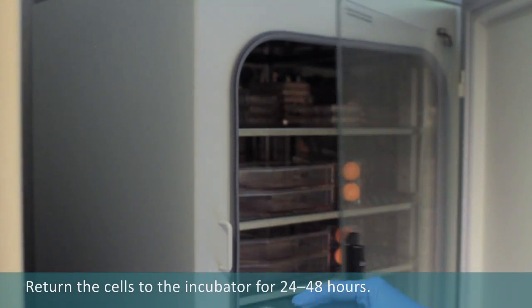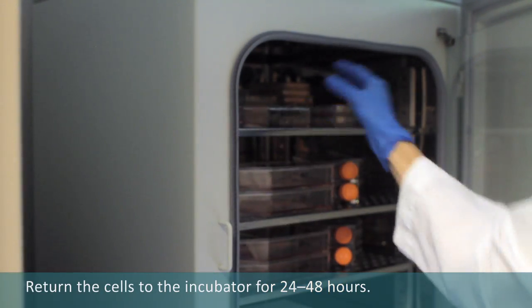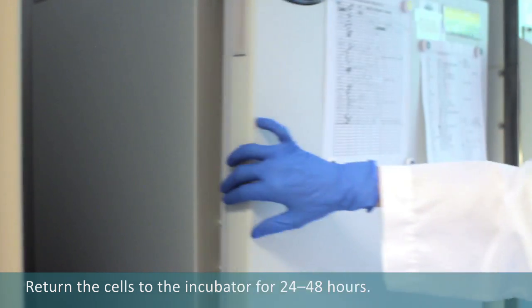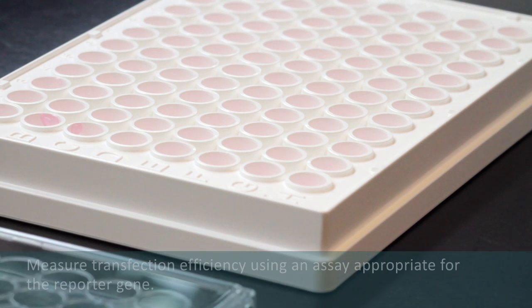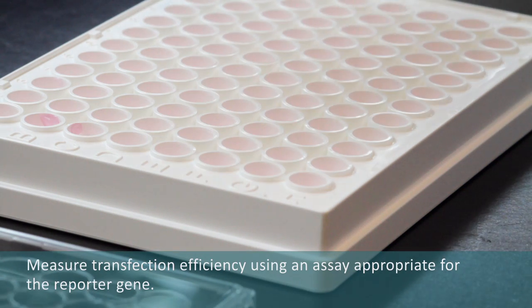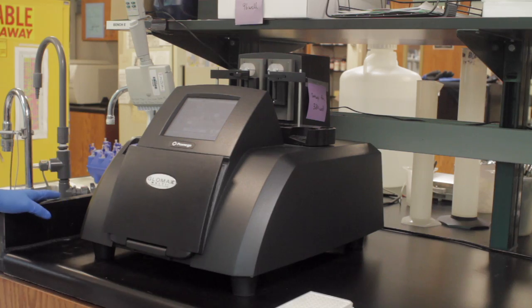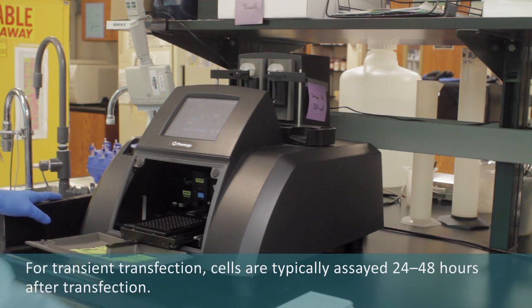Return the cells to the incubator for 24 to 48 hours. Measure transfection efficiency using an assay appropriate for the reporter gene used in your experiments. For transient transfections, cells are typically assayed 24 to 48 hours after transfection.